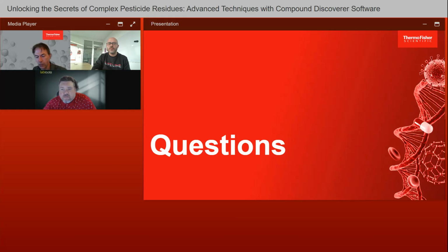It will do a targeted detection only for those internal standards. So there are a couple of advantages here. First of all, it's super fast. It will really just do a targeted detection for those internal standards. And the second advantage is that very often you would use labeled internal standards, right?